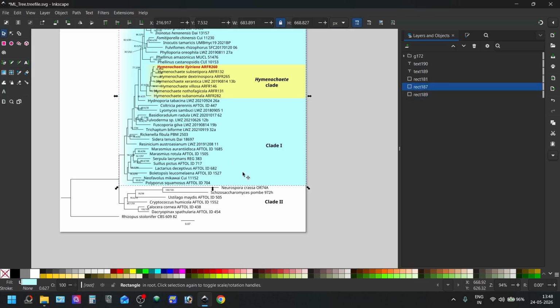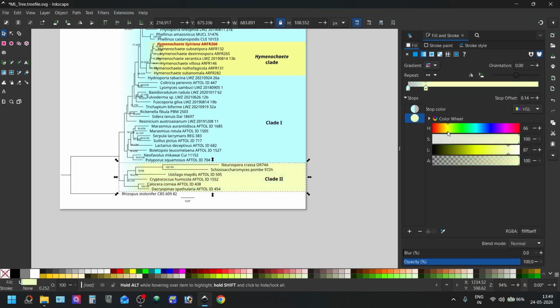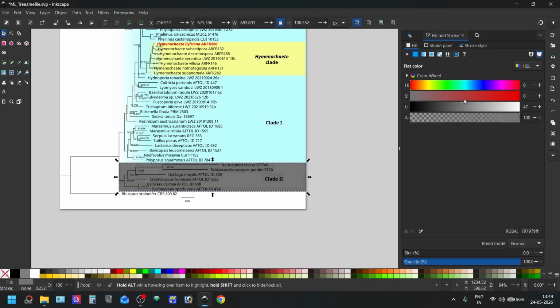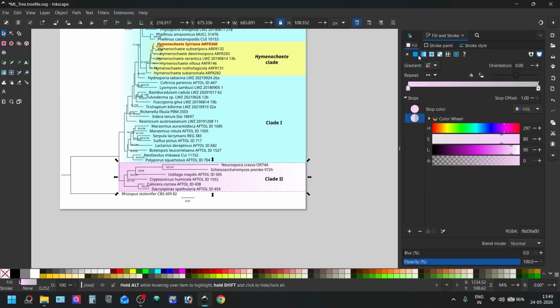Click, and then make it come down, and then do like this, then change the color to, first choose fill, then change the color to say pink, purple, pink, whatever the color you want. Then again press gradient.